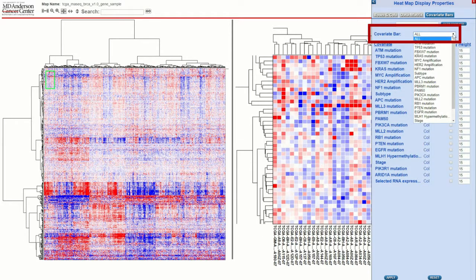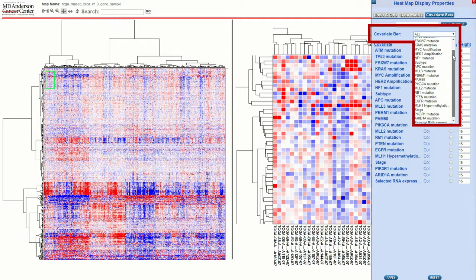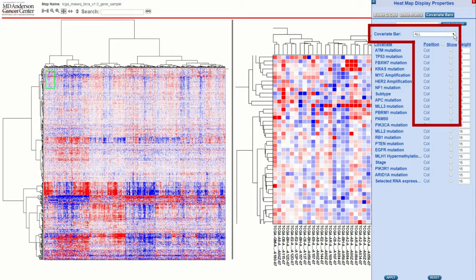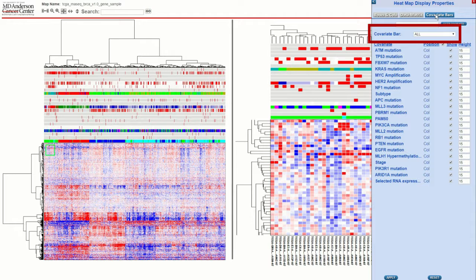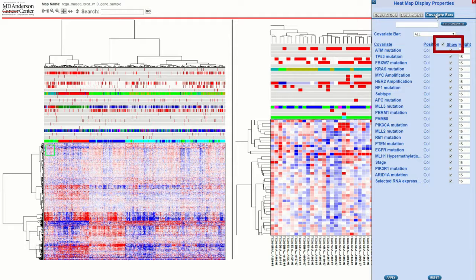On the next tab you have covariate bar information. At the top is a drop down called covariate bar. This drop down menu allows you to select a single covariate bar to configure. There is a special item in this menu called 'all' that will be selected by default. When all is selected, a list of all the covariate bars in the heatmap is displayed and you can select which covariates you wish to be displayed and adjust the height of those covariate bars. The checkbox to the left of the show column header can be used to hide or show all of the covariates.